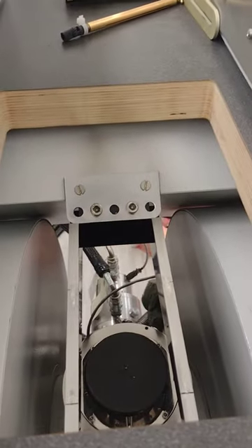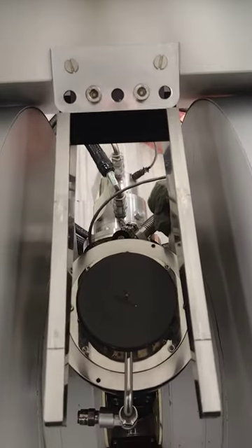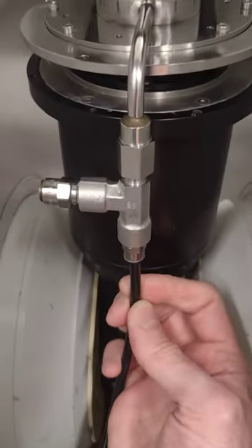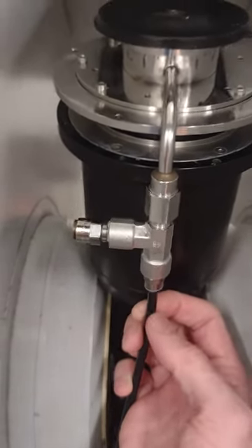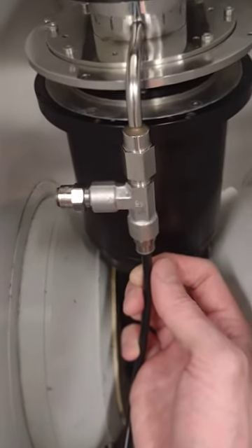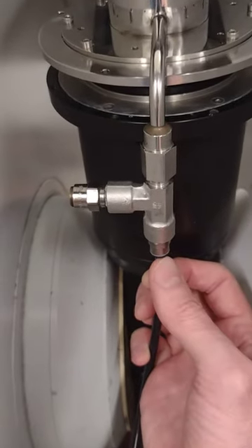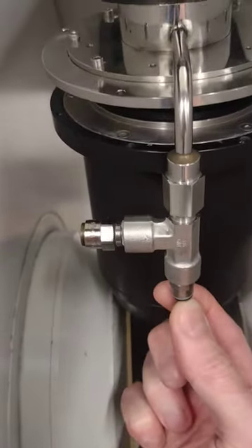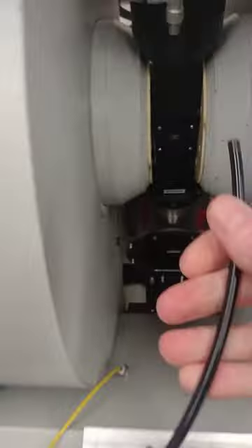We'll start to loosen the hardware mounting the Crystap in place. The very first thing is to disconnect this hose here. We have a hose arrangement like this — yours might be a little different — but basically this is where the not-as-clean helium goes into the system as a transfer gas. This is one of those connectors where you push up and then pull the hose out.